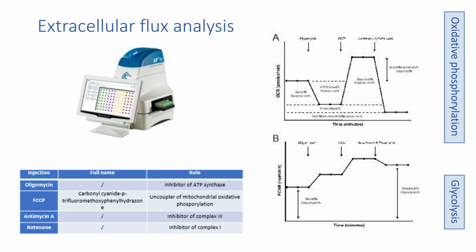But this particular piece of equipment allows you to actually measure oxidative phosphorylation and glycolysis in intact cells. And we do this on our monocytes, as I'm showing you here today, but we do it on T cells and eosinophils and neutrophils and all kinds of immune cells. And this enables you to inject the cells with a whole host of different inhibitors and activators and uncouplers of the different metabolic processes within the cells. And you can see the little table on the bottom left. It's got the 4 key drugs that I'm going to be using in the assays I'm talking about today.